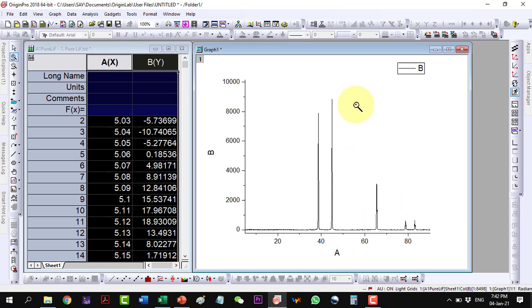Usually from the very intense peak we calculate the crystallite size, but it is much better to calculate from all individual peaks and then take the average, which we call the average crystallite size. I will calculate for the most intense peak and we can do the rest to find the average. Let me explain how to find the full width at half maximum.